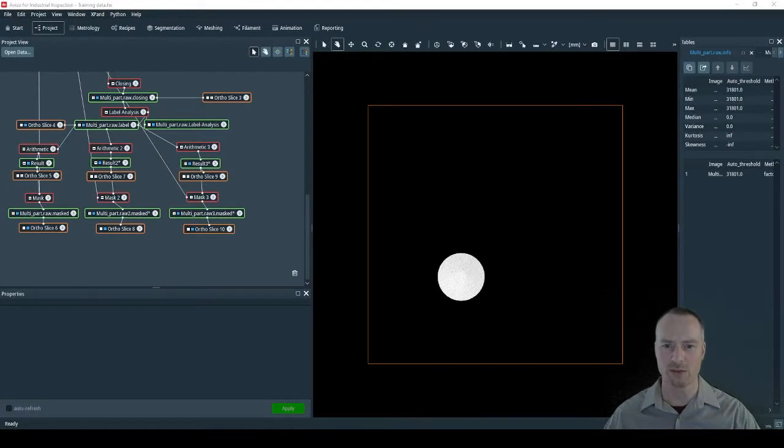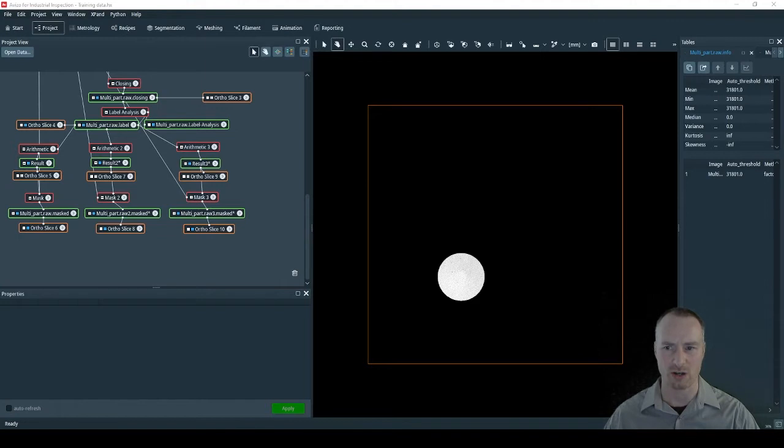We now have all three components separated and we can start analyzing the prosody associated with each component. First we will be considering component one.